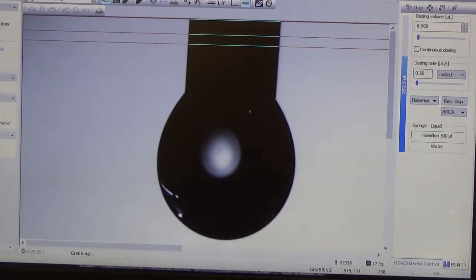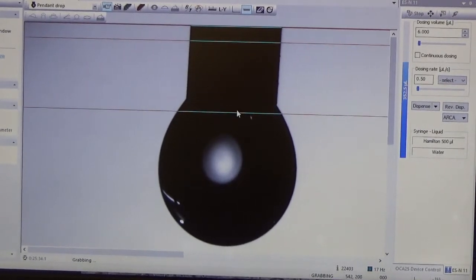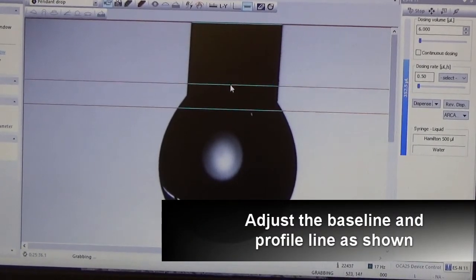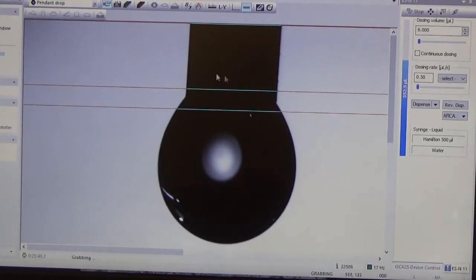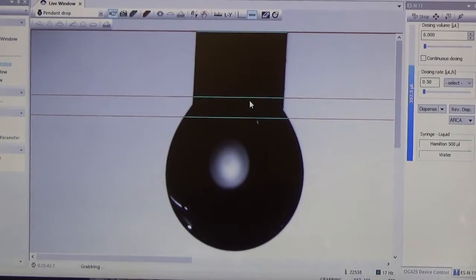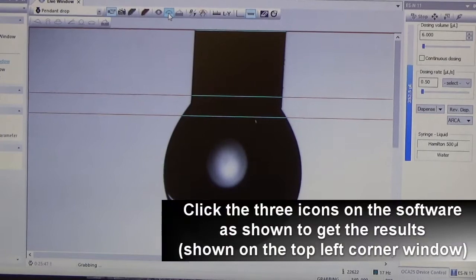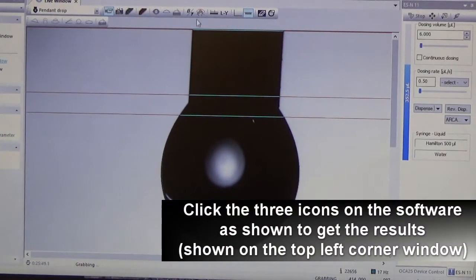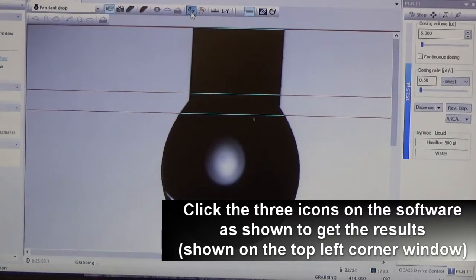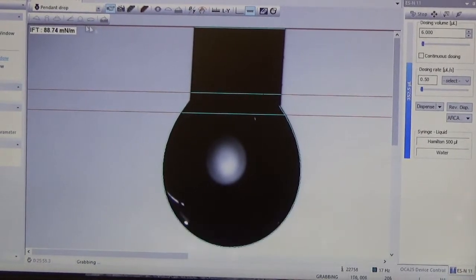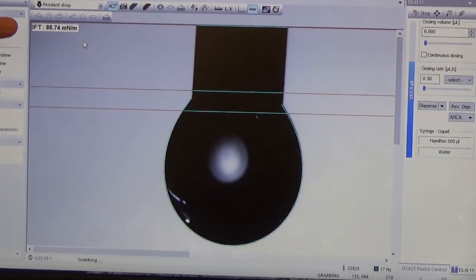Once dispensing is done, adjust the profile line so the software has a rough idea of the droplet profile shape. Then click the profile extraction to extract the profile, press calculate, and you will be able to see the value of the interfacial tension.